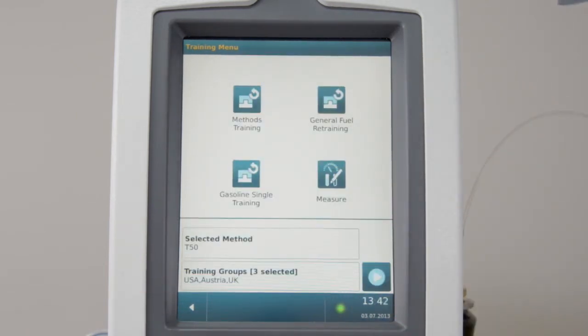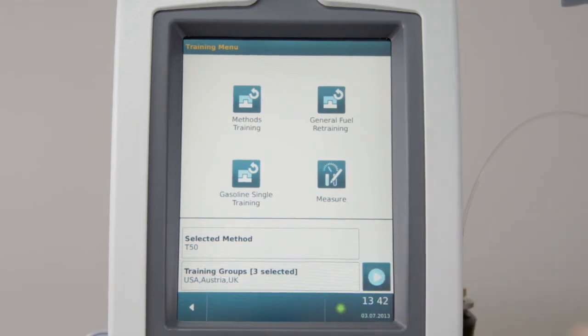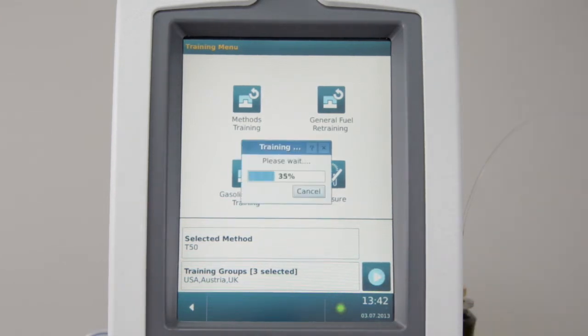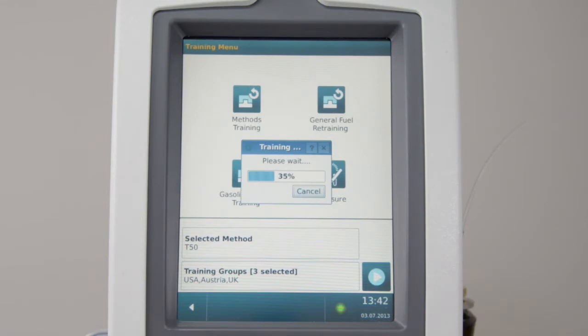Then, start the training procedure. If you want to add your fuel group to another predicted method, please repeat the single training for this method.